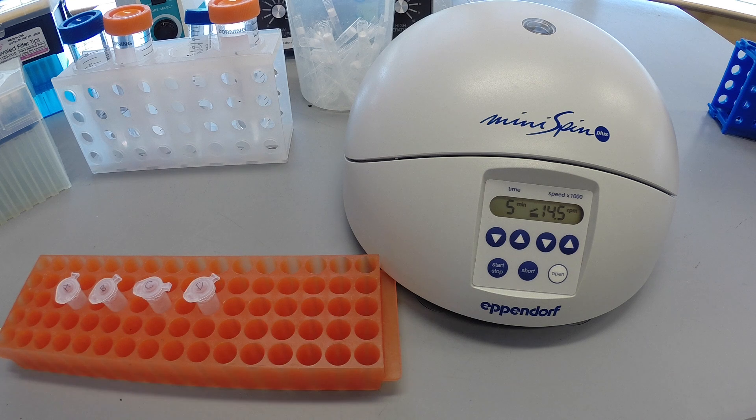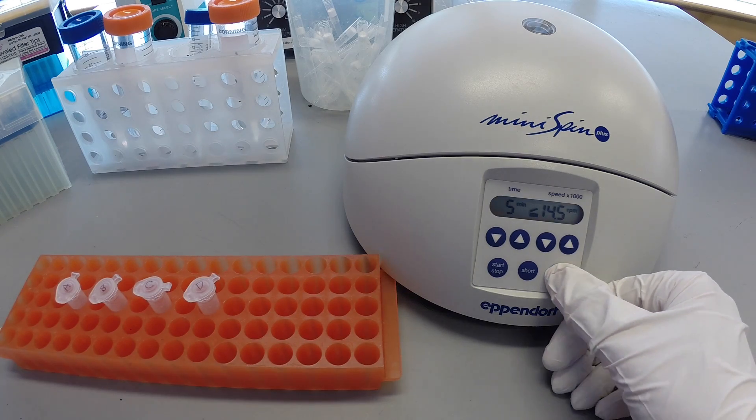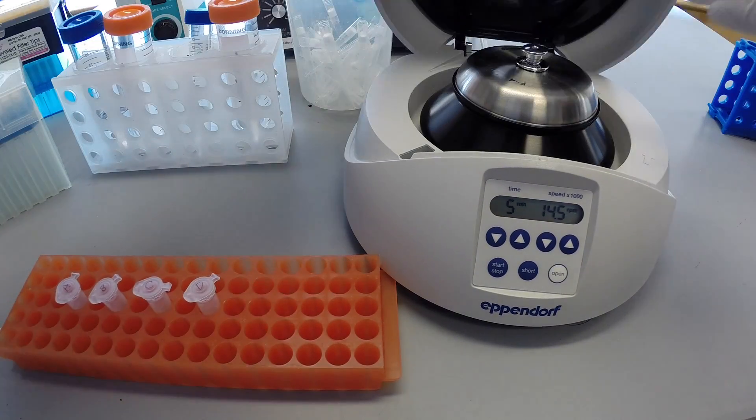After incubating at room temperature for 5 minutes, place the samples in the microcentrifuge with the hinges facing outward. Remember to balance your tubes.